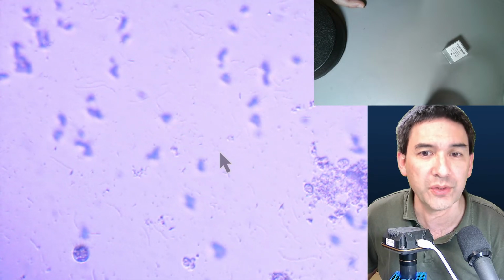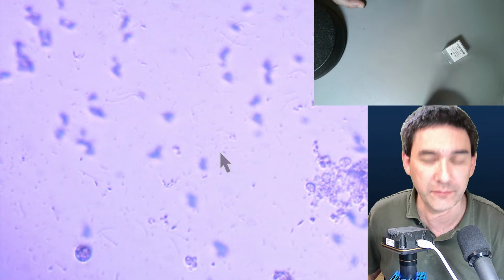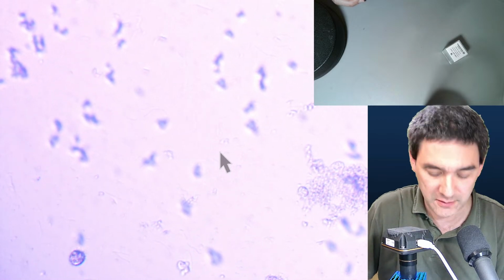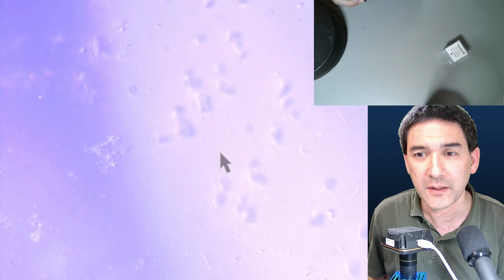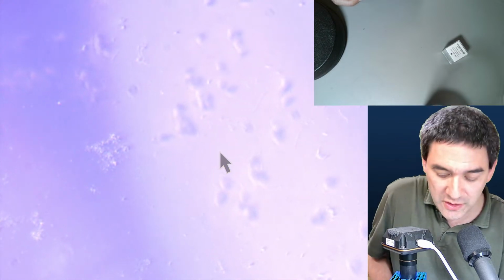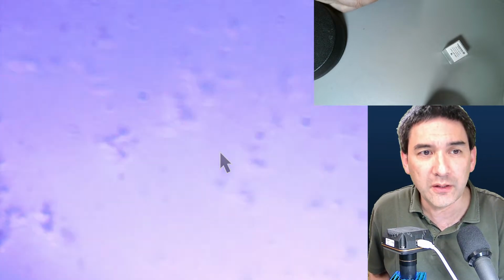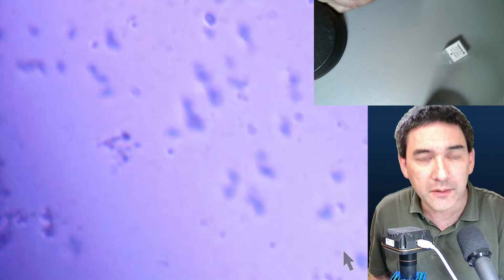And even though it does not have a condenser, by the way, this has now a 10 times magnifying objective. But I know that you probably want to see how this looks with a condenser present and with proper optics and everything. So what magnification is the question here? I'm using now my 10 times objective, and concerning the magnification, lots of people want to know what it is, and I'm going to tell you somewhat provocatively.